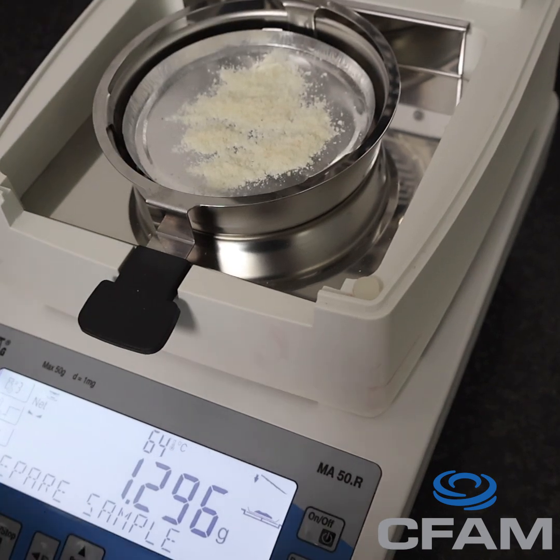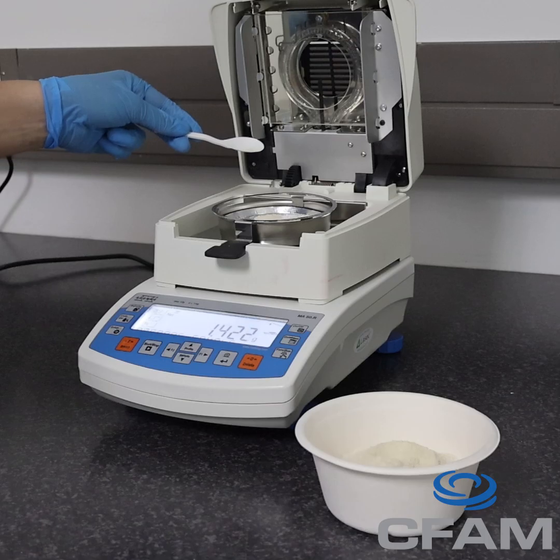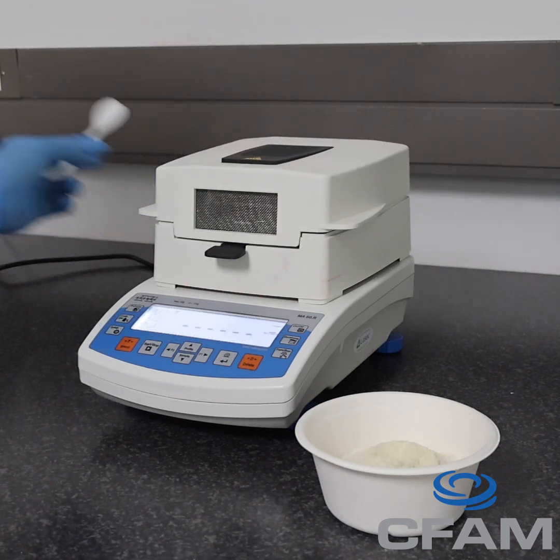Too much moisture can cause blockages or spoilage, while too little can lead to poor expansion or brittle products. To run the test, we place a small amount of the sample on the analyzer's tray.